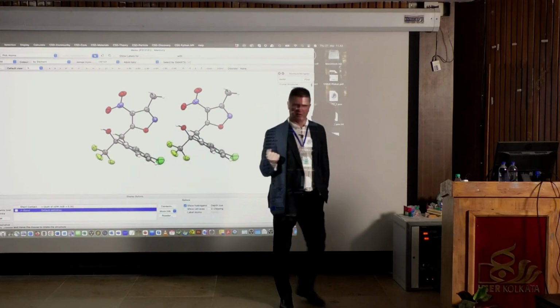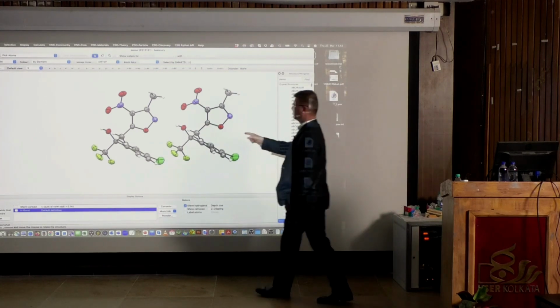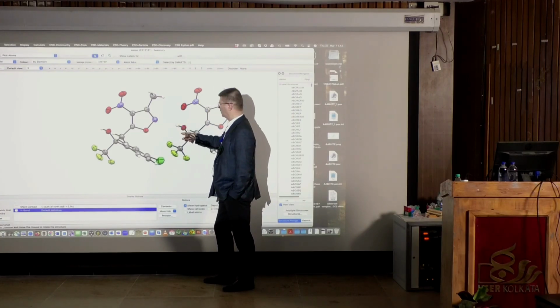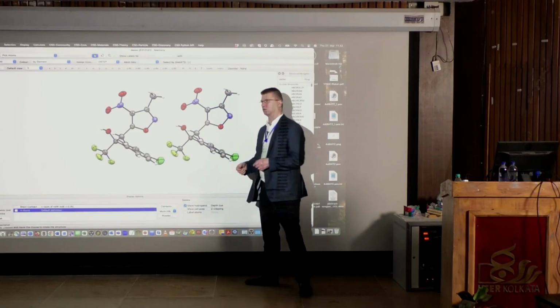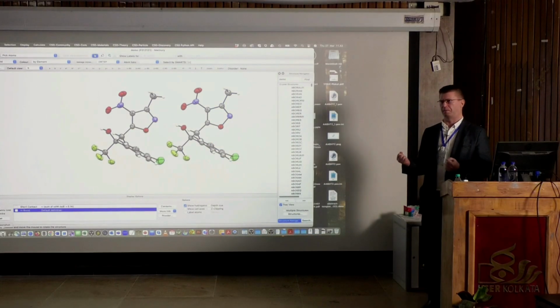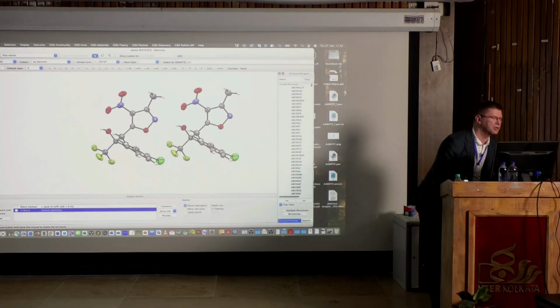But now there is another trick, because in real life these don't exist. Of course, this is just a presentation. Like in here, there's no such bond. This is only embedded, it's inside there. So this is just presentation. So in order to see this nicely, we use the space filling for this. So we do this.